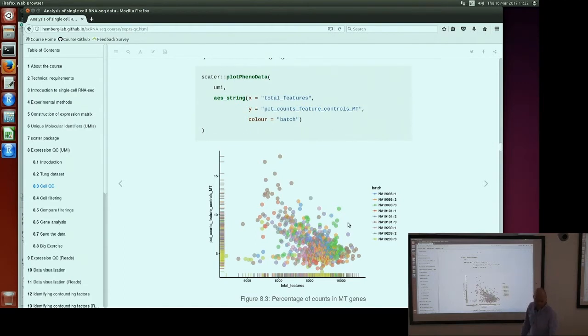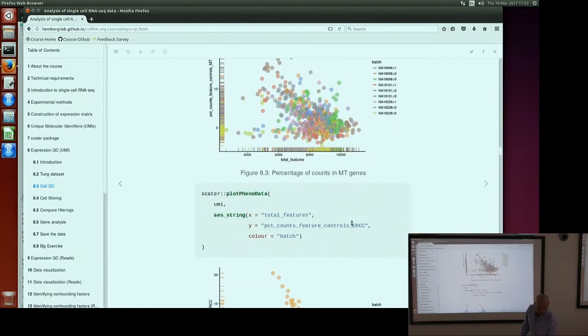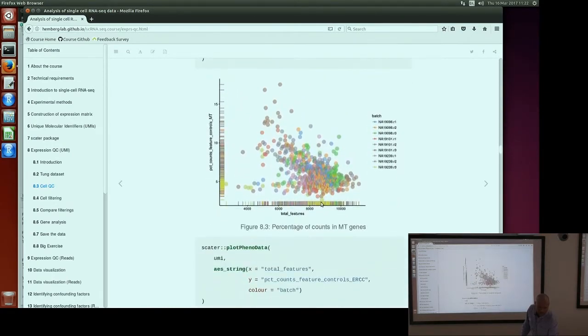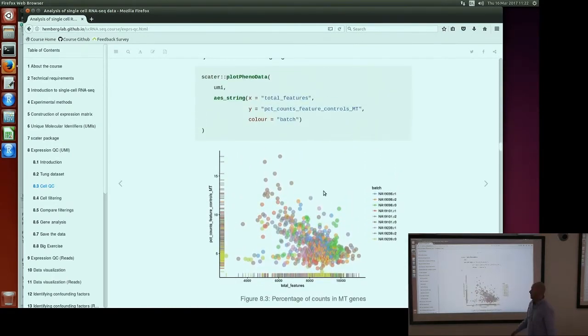So here I think we keep, so we keep this, maybe we don't keep, I don't remember. So we'll see afterwards. So you can either set a threshold here, so additional cell filter, and you say, if you have more than 15%, we cut it off. Or you can say 10%. You can also cut off before that. So, yeah.